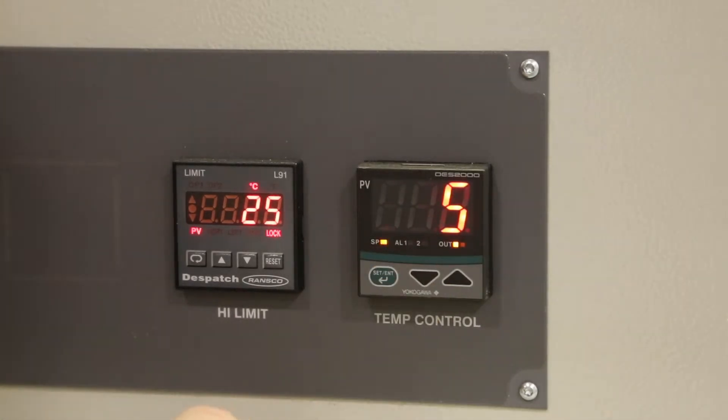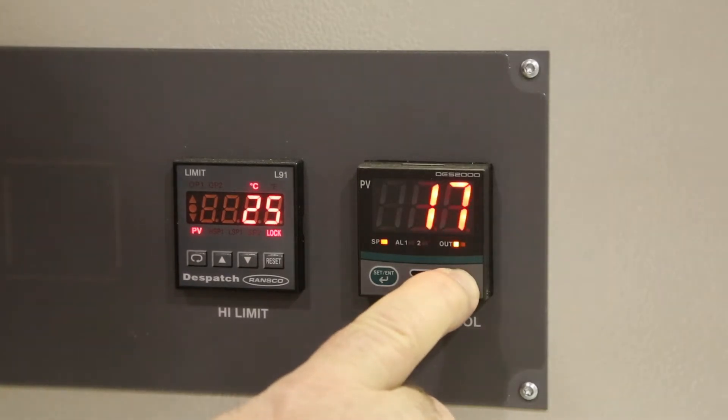Press the down arrow. For centigrade operation, that value must be 5. For Fahrenheit operation, that value must be 35. Press the up arrow until you get to 35.